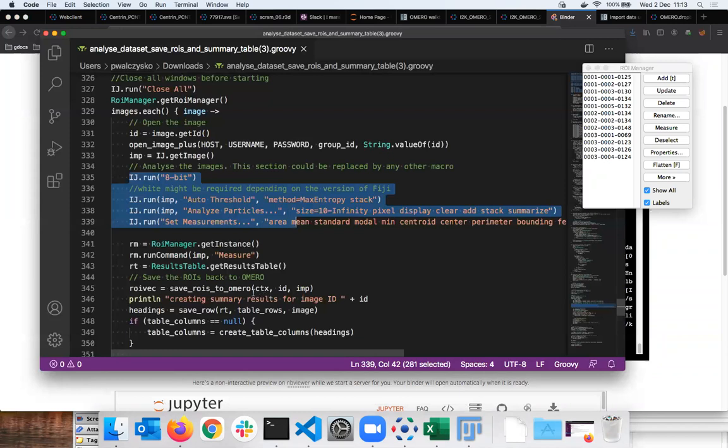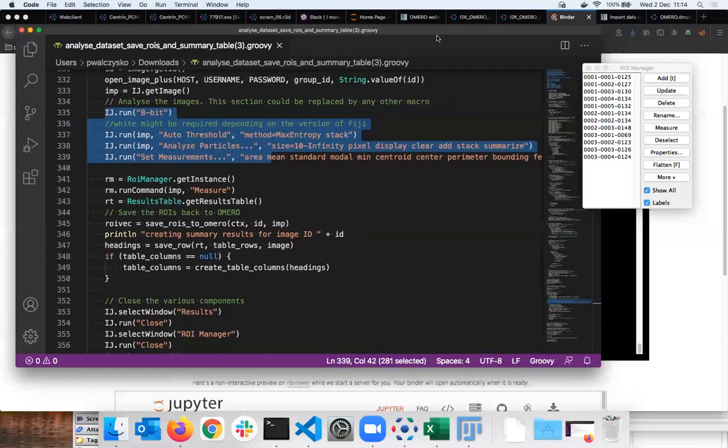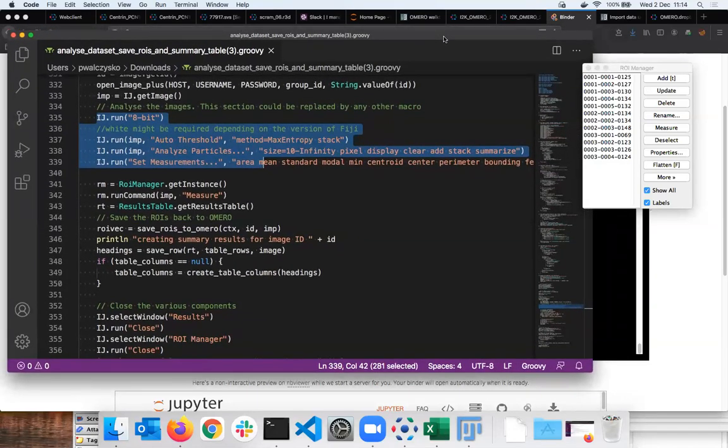Each time you work in an application, whatever that application is, you need to convert the ROI from, in that case, Fiji into OMERO, and then we save them back. Each language has its own; there is no common ROI language. We're trying to work on that, but we do the same with other software, like Peter can show the QuPath or other third-party tools. They need to be converted into the original form and put back, and then we move and associate it.